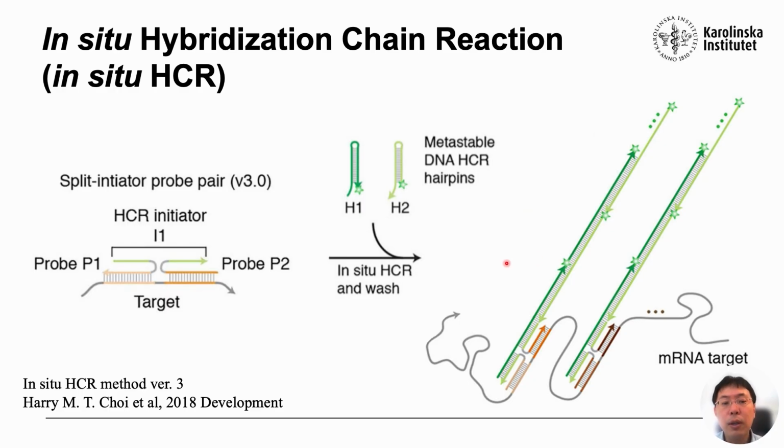This method is especially advantageous for 3D staining since the DNA probes and hairpins are small and can easily penetrate into tissue. However, achieving whole brain staining has remained a major challenge.